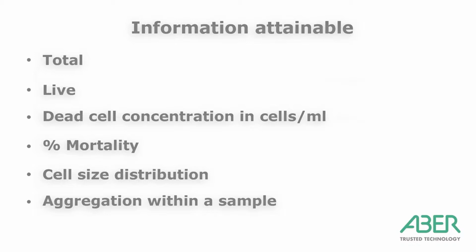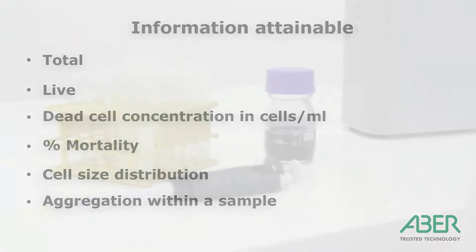It's been shown to be more reliable than manual cell counting techniques with smaller deviation and takes under 20 seconds to analyse a sample, thus making it less labour intensive.